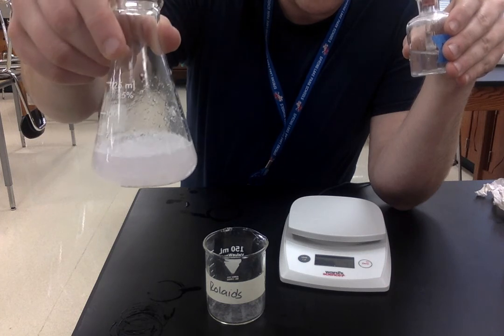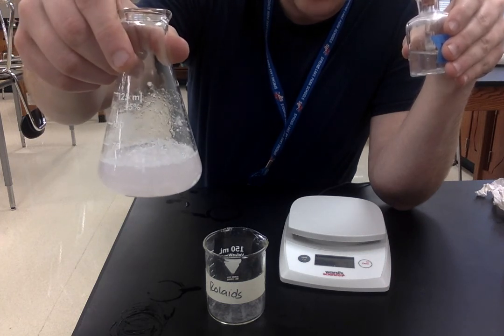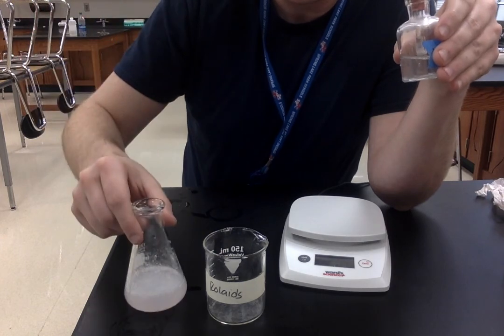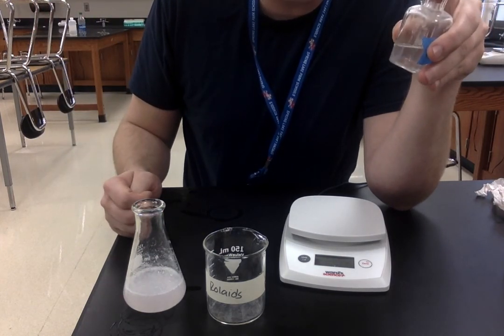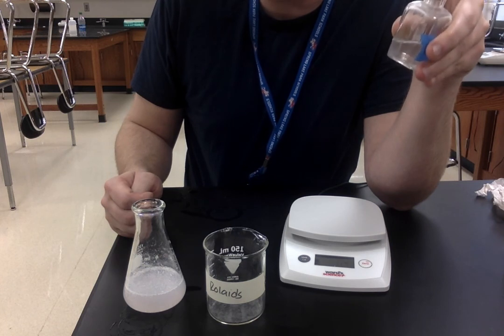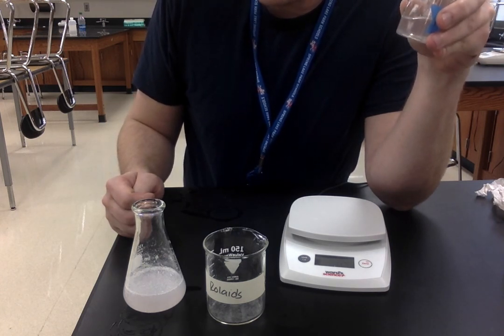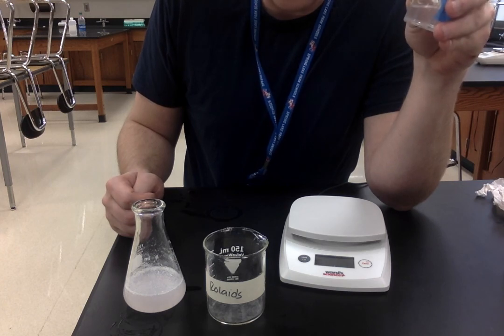It might be a little bit tough to see, but now the solution is a tiny bit pink, so go ahead and record the number of drops. Then take the number of drops divided by the mass in grams — that would be your drops per gram. Then go ahead and try to answer the conclusion questions.